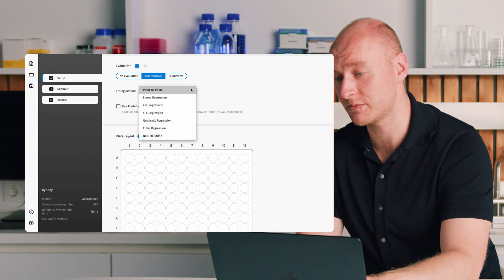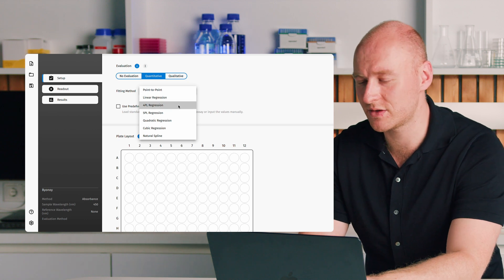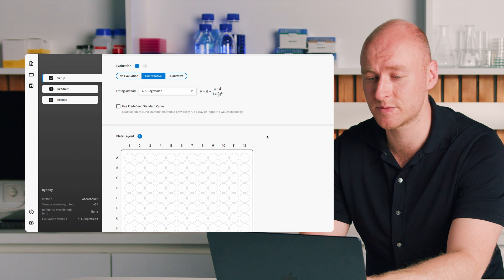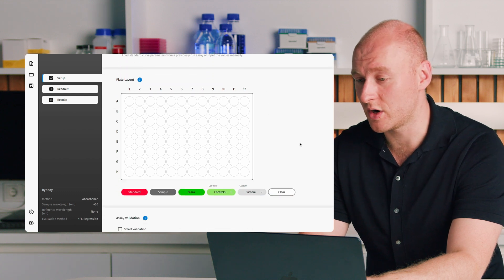We can select a fitting method — we have various fitting methods available, for example a four-parameter analysis. We can then move on to our plate layout. The plate layout in our software is designed very intuitively, working somewhat like a paint program such as Microsoft Paint — whatever you click is what you draw or paint onto the microplate in the software.